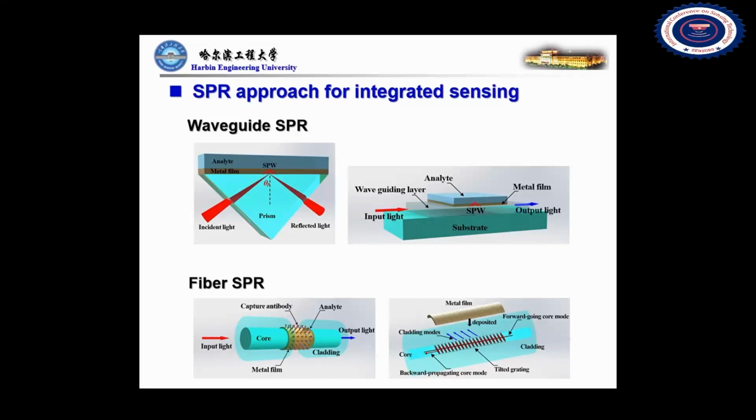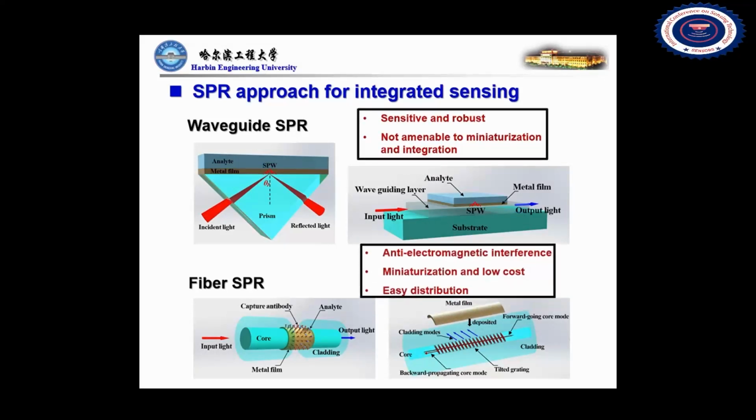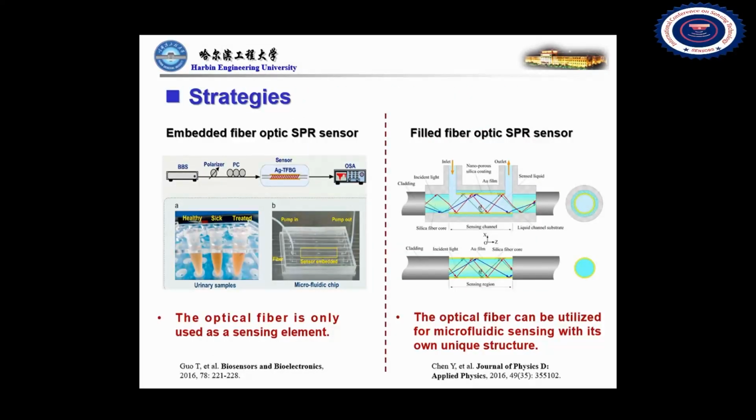In recent years, fiber optic SPR sensor has been widely concerned by scientific researchers and became a substitute for prism coupling system and has wide applications in the field of basic biochemistry to pathological detection. Fiber optic SPR microfluidic sensor is to combine microfluidic technology with optical fiber SPR sensing technology and achieve the detection of low-dose fluid samples with high performance.